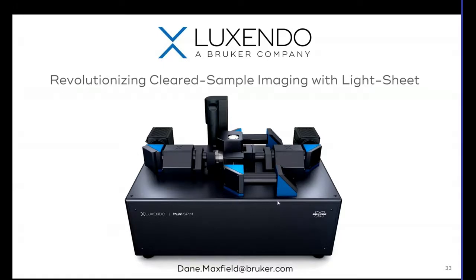Thank you. Okay, so we have one here. What about imaging in organic solvents with a higher refractive index of about 1.56? So that will require a different lens set. So we will have a cuvette solution for that. The lenses that we're using aren't really good for imaging in these harsh organic solvents, and so we'll end up keeping that sample in a cuvette and using different lenses to image with that.